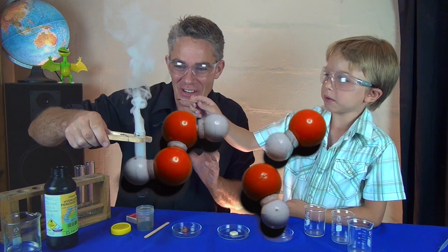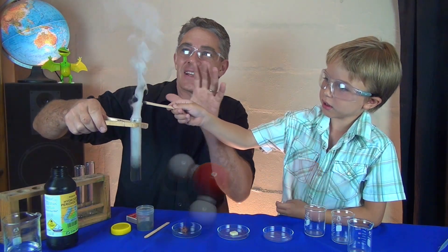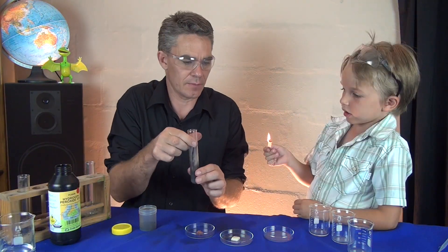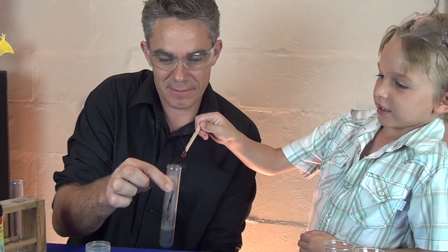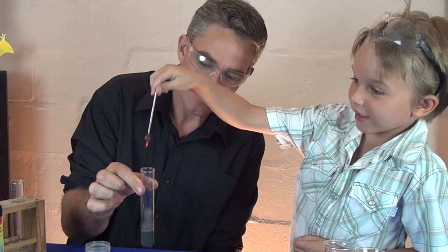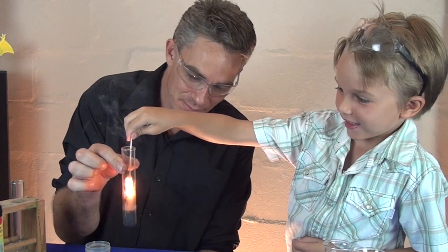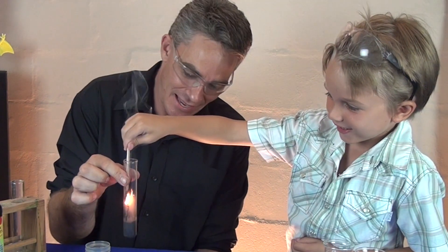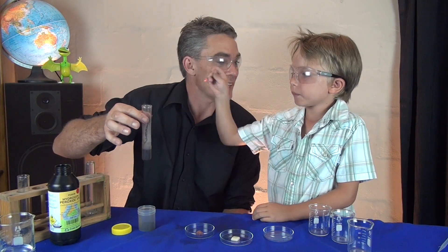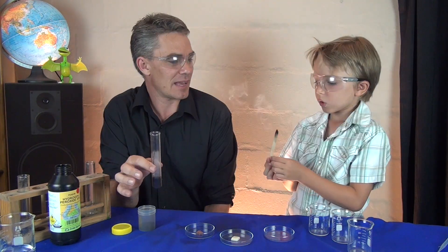That hydrogen peroxide is turning into oxygen gas and water. And because it's so hot it carries out steam with it as well. Blow it out. Put your paddle pop stick in. Look! Pull it out. And put it back in. And pull it out. What happens Sam? It lights up again. Yeah, it lights up again. The hydrogen peroxide is decomposing into oxygen and water, and the oxygen relights a glowing splint.